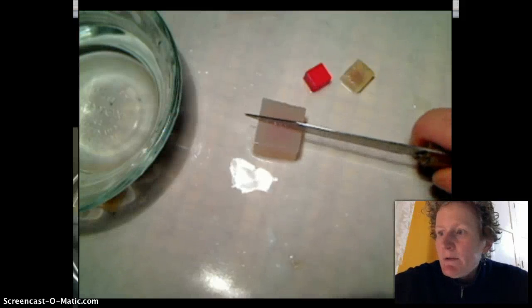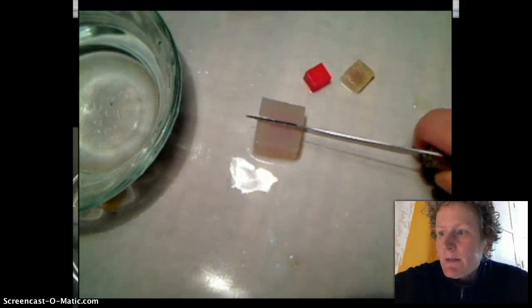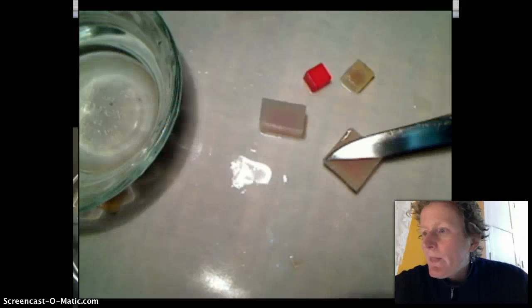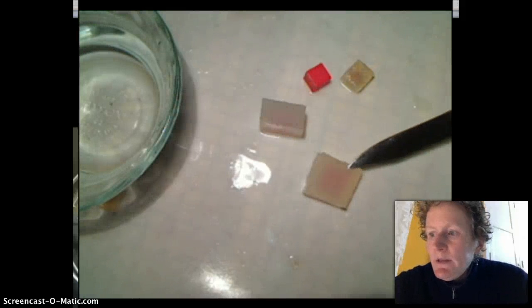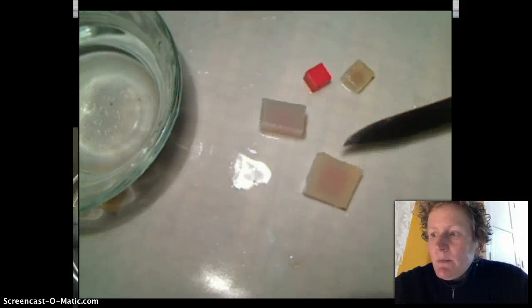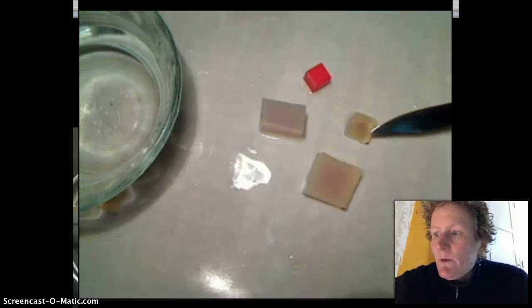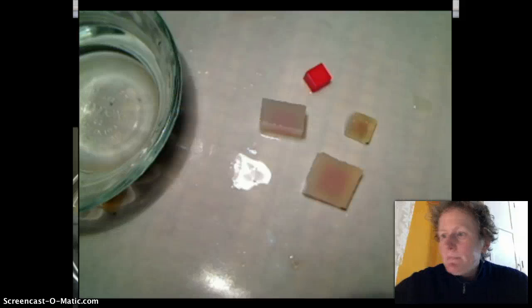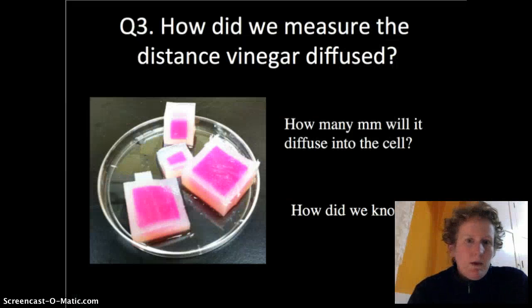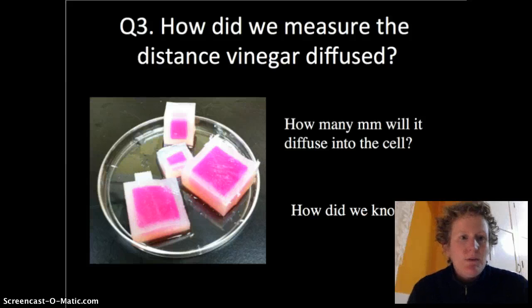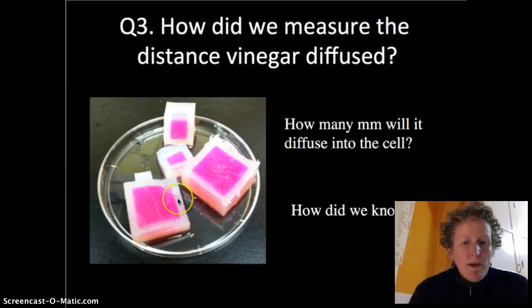While we're waiting for the vinegar to diffuse in the giant 10 by 10 by 10 centimeter cube, we can cut open a 2 by 2 centimeter cube for comparison. And you can see it made it about the same distance into the 2 centimeter cube as it did to the 1 centimeter cube. So question three, how did we measure the distance vinegar diffused? Well, we measured the distance of the white part of the cube.